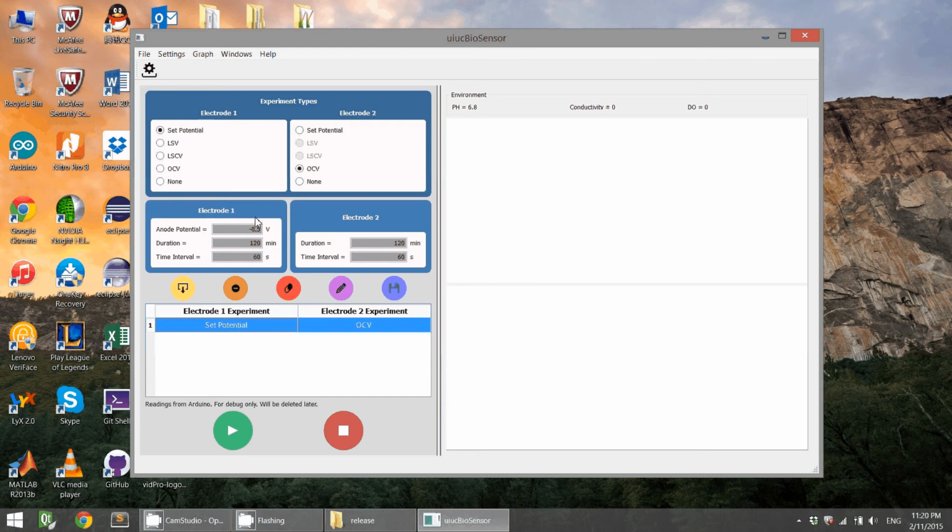One of the changes is all the data here, all the line edits, have been grayed out, which means it's read only, so basically it's locked. This was requested by Professor Cusick. The other change is that this edit button is actually enabled. If I click on this button, all these lines become enabled, and you can go back and change to whatever you want. So let's see, I mistakenly set it to 1.